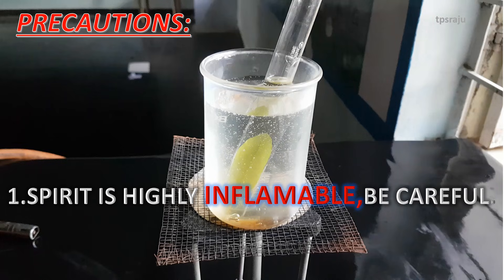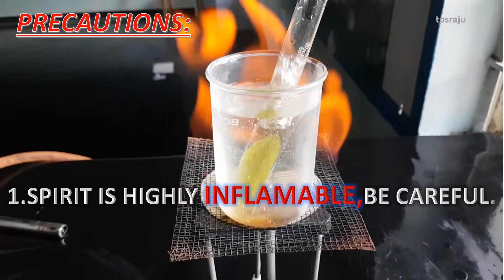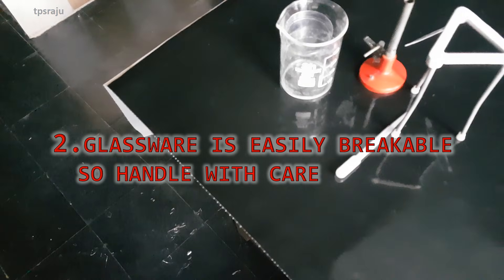While doing this experiment, we should follow some precautions. Spirit is highly inflammable — be careful. Glassware is easily breakable, so handle with care.